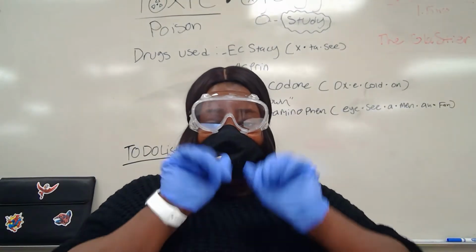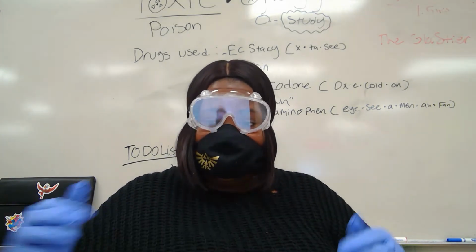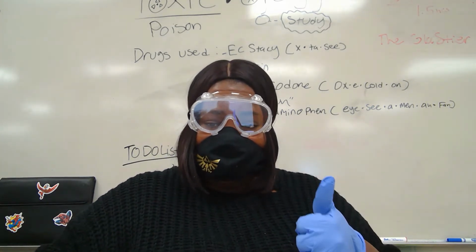So, with every lab that deals with chemicals, you'll always need your gloves and goggles, because safety first. Let's go.